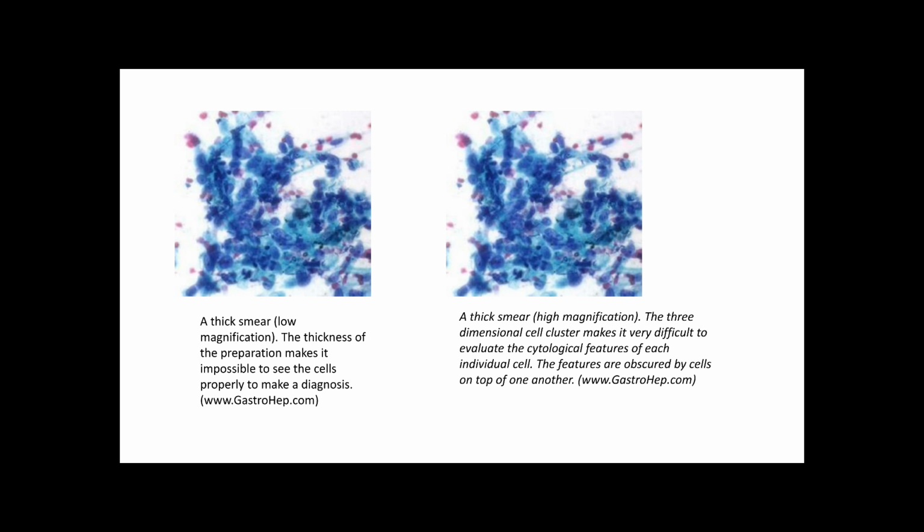So here you can see the thick smear, low magnification. The thick smear preparation makes it impossible to see the cells properly to make the diagnosis. So this is very thick. This is not a single cell layer.